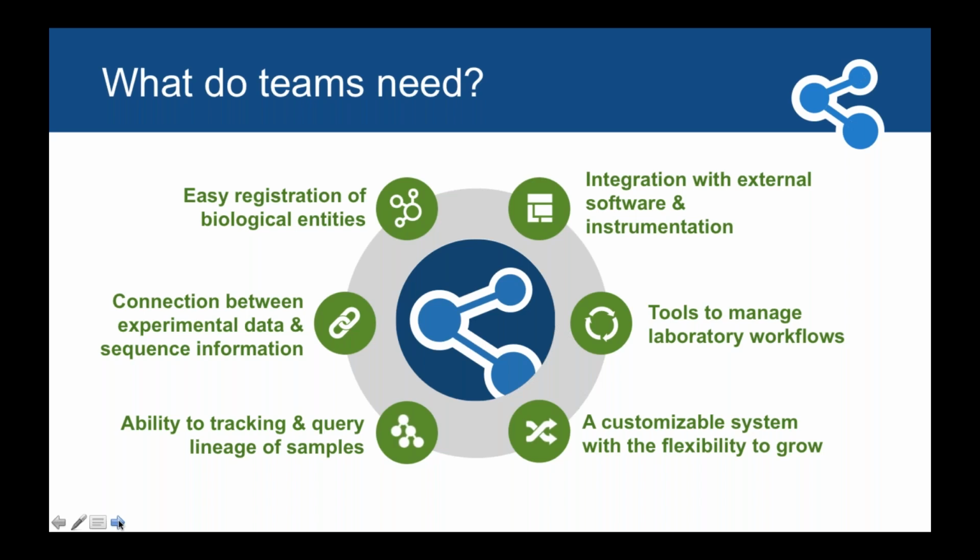Additionally, tools to manage laboratory workflows. In any of these instances, it's rare to have a single scientist doing all of these bits and pieces. We needed tools to help foster communication, make requests, and understand what data had been submitted or not, and so building a workflow management tool was a key component.